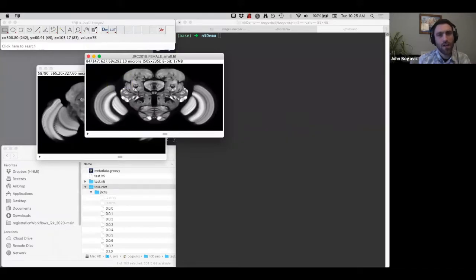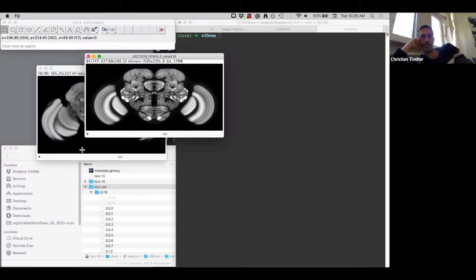Yeah. So what it does, and what it should do, is read chunks that aren't entirely written and only overwrite the part of the chunk that is contained within the thing to be overwritten. So you should see it behave the way you would want. And the downside is it can't only write. It has to read some chunks in order to not lose data.